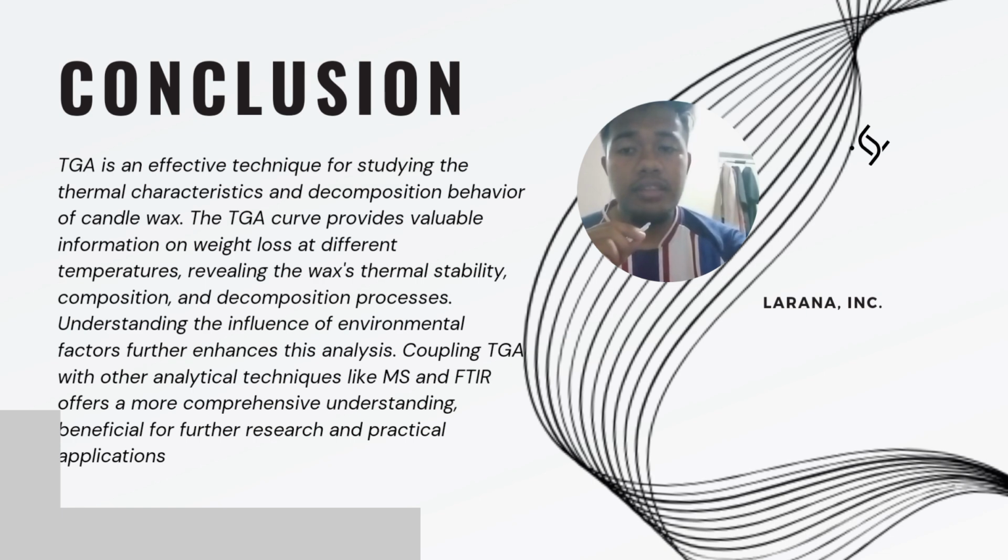In conclusion, TGA is an effective technique for studying the thermal characteristics and decomposition behavior of candle wax. The TGA curve provides valuable information on weight loss at different temperatures, revealing the wax's thermal stability, composition, and decomposition process. Understanding the influence of environmental factors for future analysis.